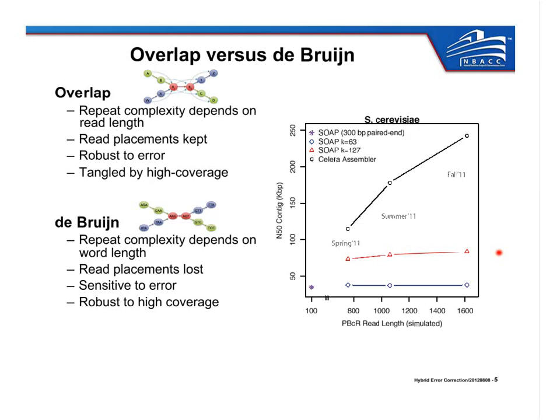I guess I'll also make this point to note. I'll bring up that ALLPATHS-LG had a paper released about 2 weeks ago that also showed support for PacBio data. In the next slide, I'll show our approach, but I'll just give a preface to the ALLPATHS approach, since I'm sure many people have seen that paper. It does the opposite approach that we do. So we do error correction, and then we do overlap-based assembly. ALLPATHS-LG does De Bruijn assembly first on short read data, and then it tries to do this kind of read threading problem with the PacBio reads in the scaffolding phases. So we can talk more about the comparisons of those two methods in the discussion following the slides.